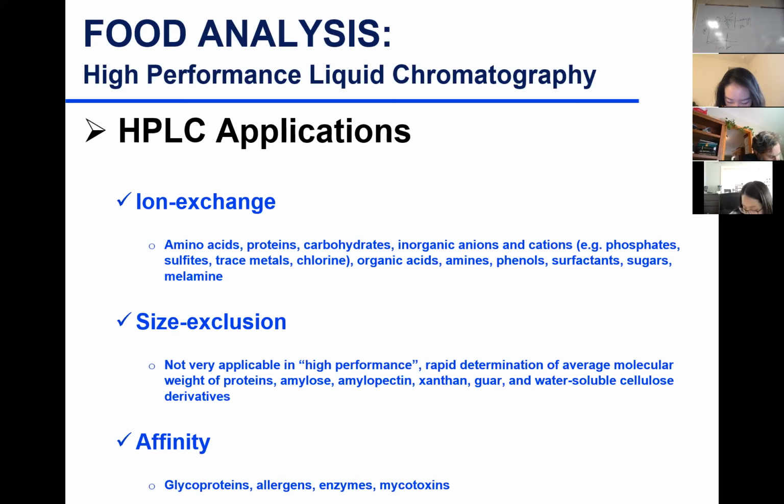Size exclusion is often used as a preparatory method of separation. So it's not often used in high performance liquid chromatography, but we can use it in high performance liquid chromatography if I'm only after separation based on molecular weight and I want to determine the molecular weight of my components. Then I would use it in an HPLC manner.